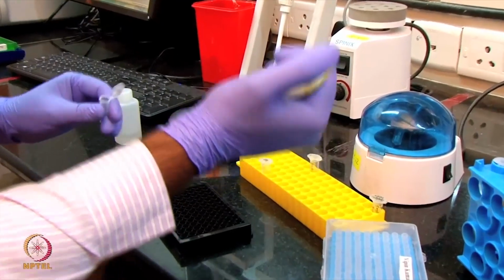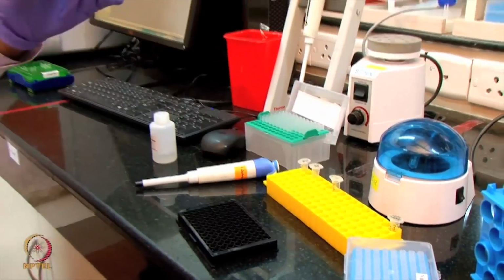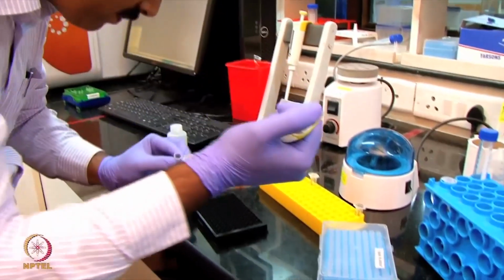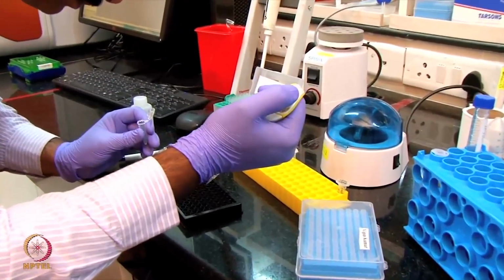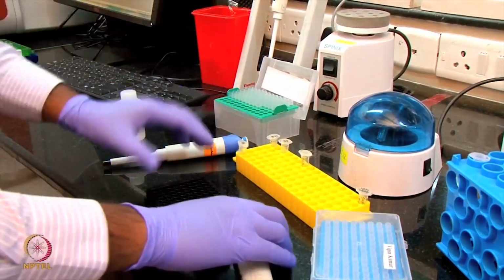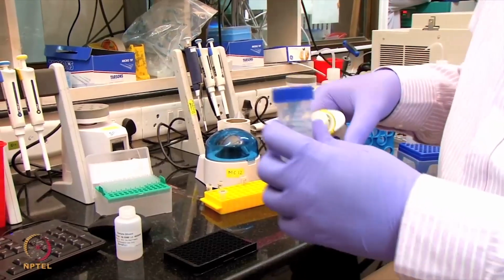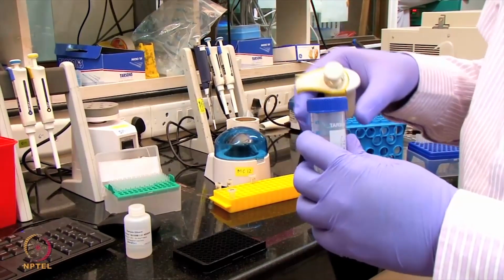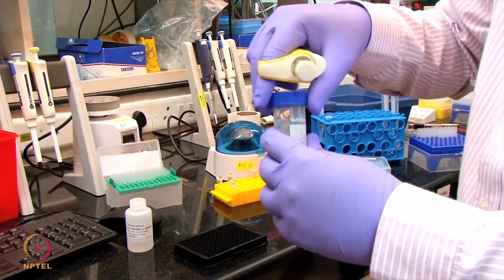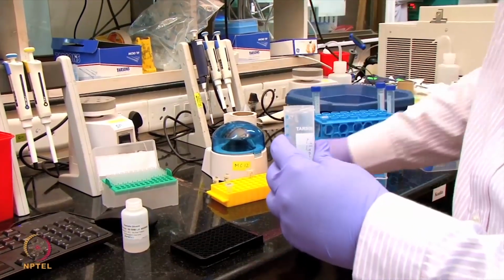Which is sample number 2 at B4. The sample number 3 at B5. So there are 3 unknown samples. I'm using the glycine buffer, that is a pH 2, 10 millimolar glycine buffer. This is used for the regeneration of the sensor.